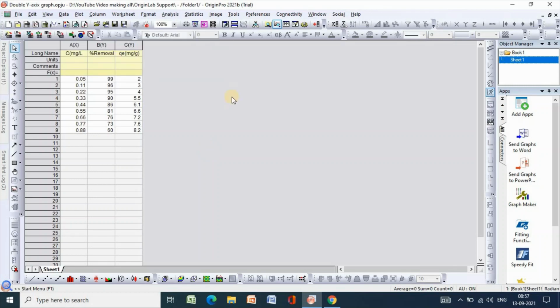In my previous videos, I explained how to draw several plots using Origin tips and tricks. In this video, I would like to show you how to plot stack graph using OriginPro. Well, stack graph is suitable for plotting multiple samples in several graphs where one graph is attached to another. So let me show you how to do it.